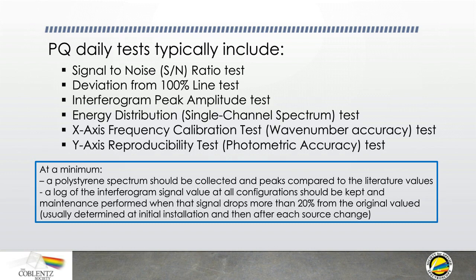So this test will run, and it will give you a printout that you can use day-to-day to check the health of your instrument. And I will say this flat out: doing this routinely is incredibly important. This morning I spent my time dealing with an instrument that's located in the UK. It's not an FTIR, but it's still an optical instrument, where we have a very unsophisticated user and something is wrong. And by being able to go back and look at the data that was collected on that instrument every single time it was used, we're using that to diagnose what's wrong with that instrument.